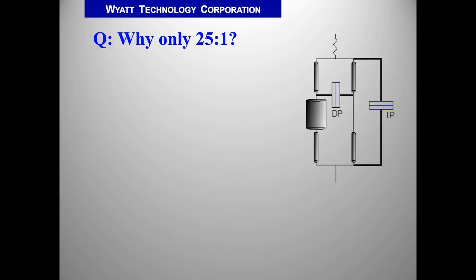But once you put that holdup reservoir in, it affects the balance of the performance of the bridge in perhaps a surprising way. What we discovered in the last couple of years is that this bridge design, which has been used for a long time, is really limited by this large volume in the holdup reservoir. Namely, the fluid in here has a very small amount of compressibility.